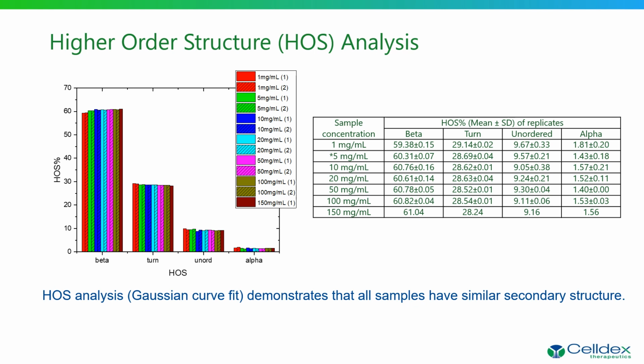I should add that this is not surprising, as we have had this same antibody formulated at lower concentrations with no discernible impact on its structure.